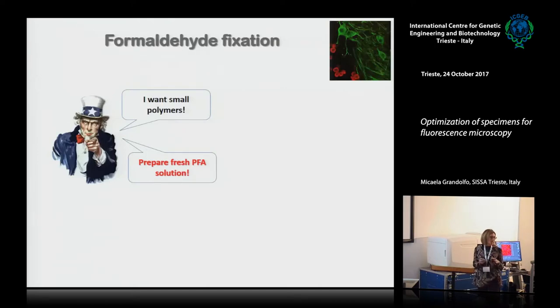If you need to have something already prepared because you do not have time, you have to prepare it in advance and store it at minus 20, okay? Otherwise, you cannot control the efficacy of the fixation, because you do not know which is the balance between the effective molecule, the effective monomer, and the polymers. Okay? It is really critical, believe me.